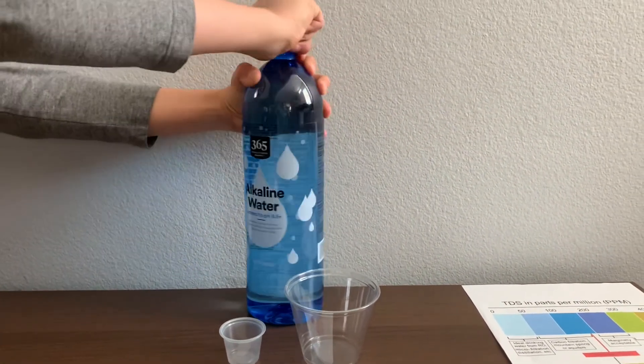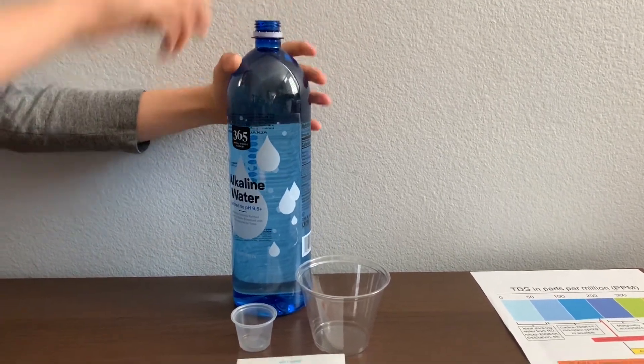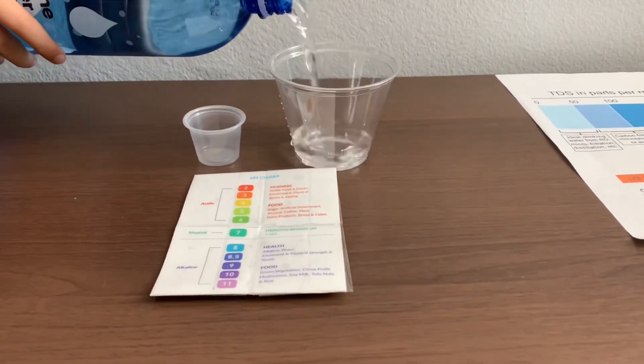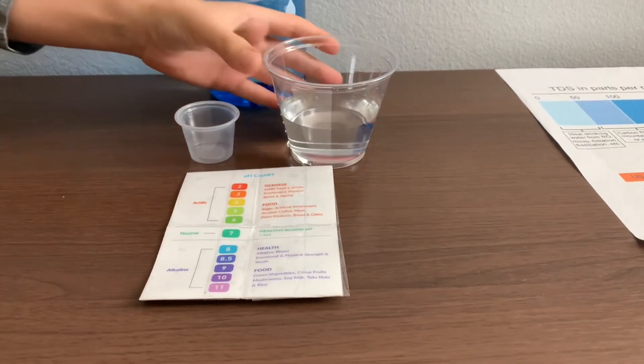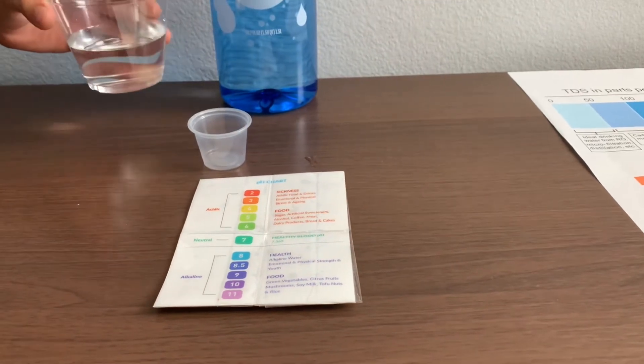Let's test the pH and TDS levels. Let's pour some water in. I'll pour the water from the pH cup to the TDS cup to the pH cup because the bottle is too big.